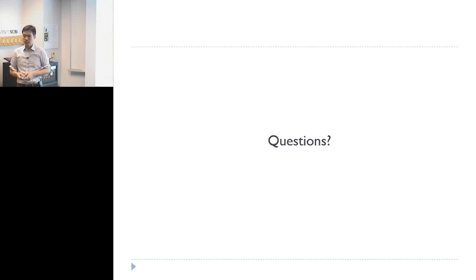So do you have a sense from using this tool how many of the unidentified spectra you're getting that are due to unknown post-translational modifications versus maybe a non-tryptic fragment when it was supposed to be a tryptic digested sample? So oftentimes when we see these non-tryptic fragments, it's from in-source decay, so we get cleavage from the N-terminus, and that often results in a very negative mass. And these very negative masses, we do observe them in our profiles, but it likely accounts for maybe less than 5% of all these other things.